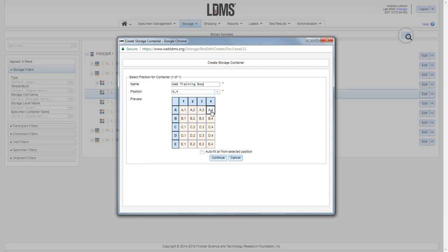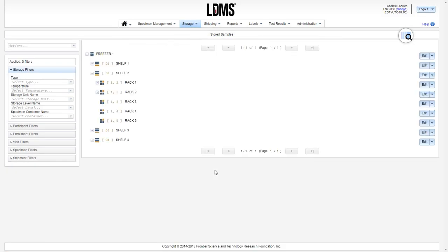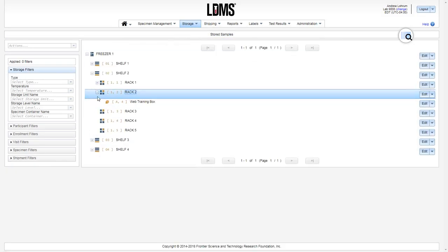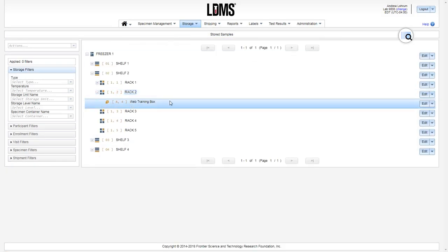The first available position is highlighted for you based upon the fill order of that rack, but you may choose any position by either clicking or using the drop down menu. Click continue to assign the box that position. And here we see our empty box.